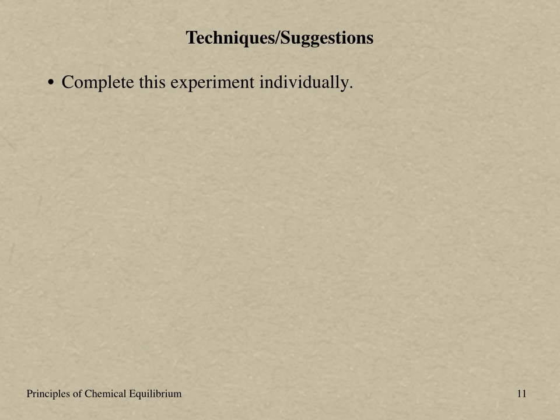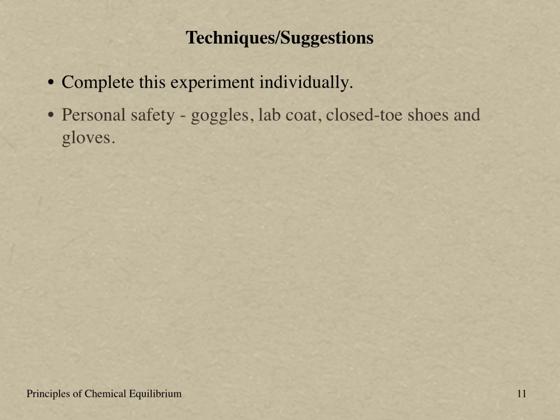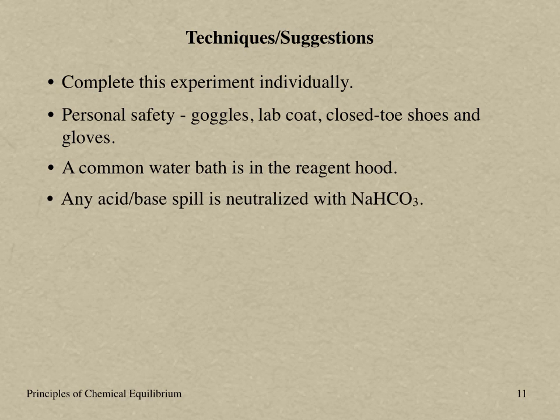This experiment is completed individually. Normal safety precautions include wearing of goggles, lab coat, closed-toe shoes, and gloves. A common water bath is provided if any reaction solution needs to be heated. Any acid or base spill is neutralized using sodium bicarbonate.